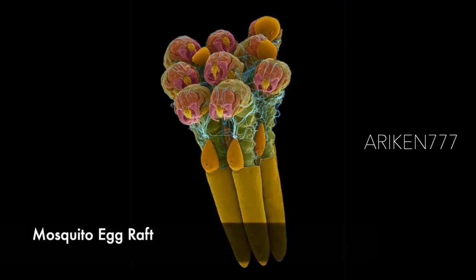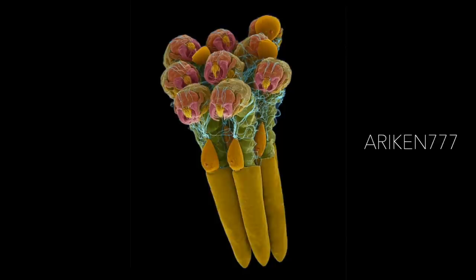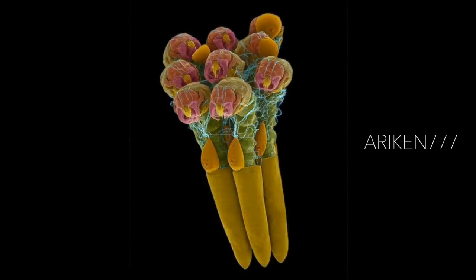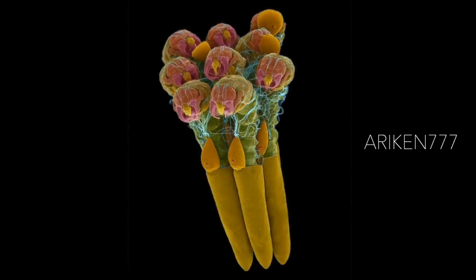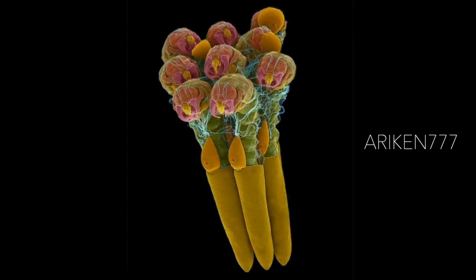Mosquito egg raft with hatching larvae. Culex species of mosquitoes lay their eggs in the form of egg rafts that float in still or stagnant water. The mosquito lays the eggs one at a time, sticking them together in the shape of a raft. An egg raft can contain from 100 to 400 eggs, and larvae will hatch from an opening at the tip of each egg case. The eggs go through larval and pupal stages, feeding on microorganisms such as plankton, before developing into adult mosquitoes.